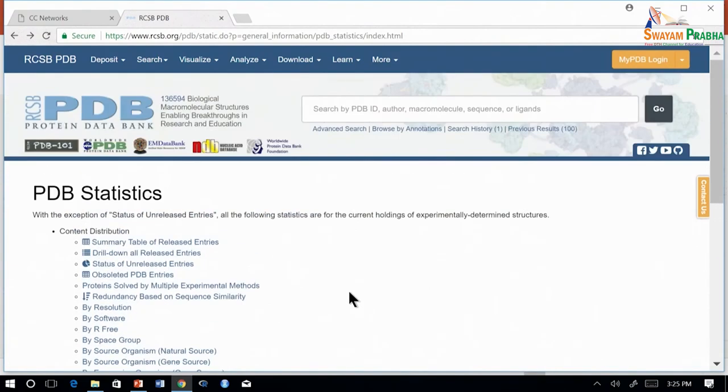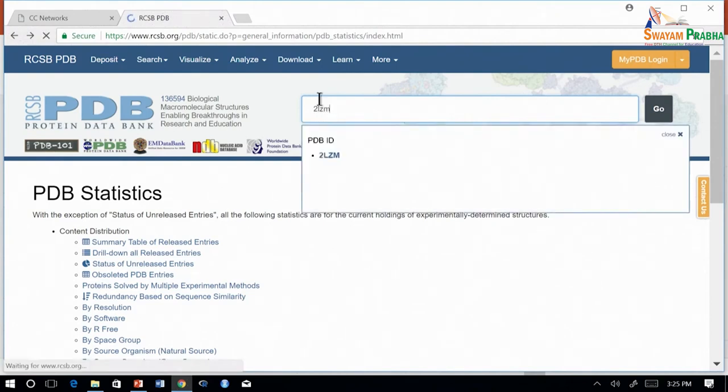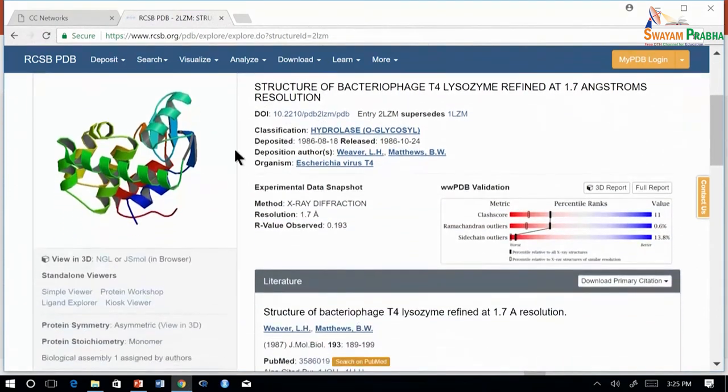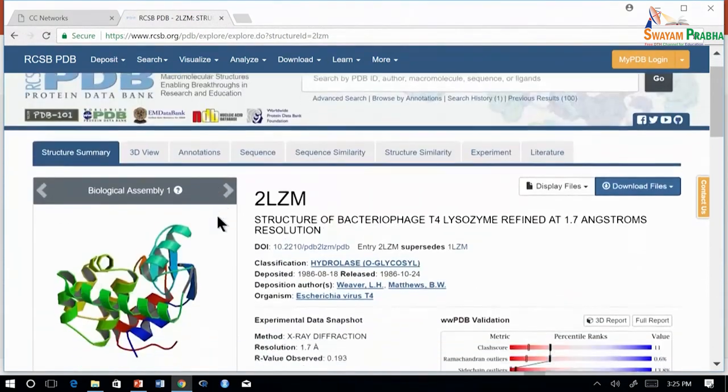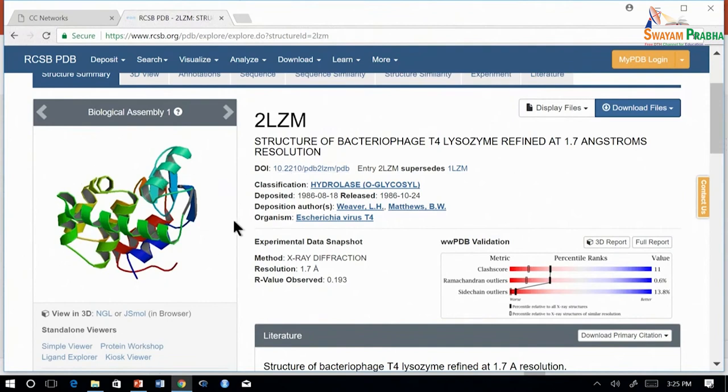Now let us go further with an example. We type 2LZM in the search bar and press enter. When we type any PDB ID, the website gives a summary page view of the structure. So we have a static view of the structure here, the title, as well as basic information about the experimental technique as well as the protein structure which is given here.